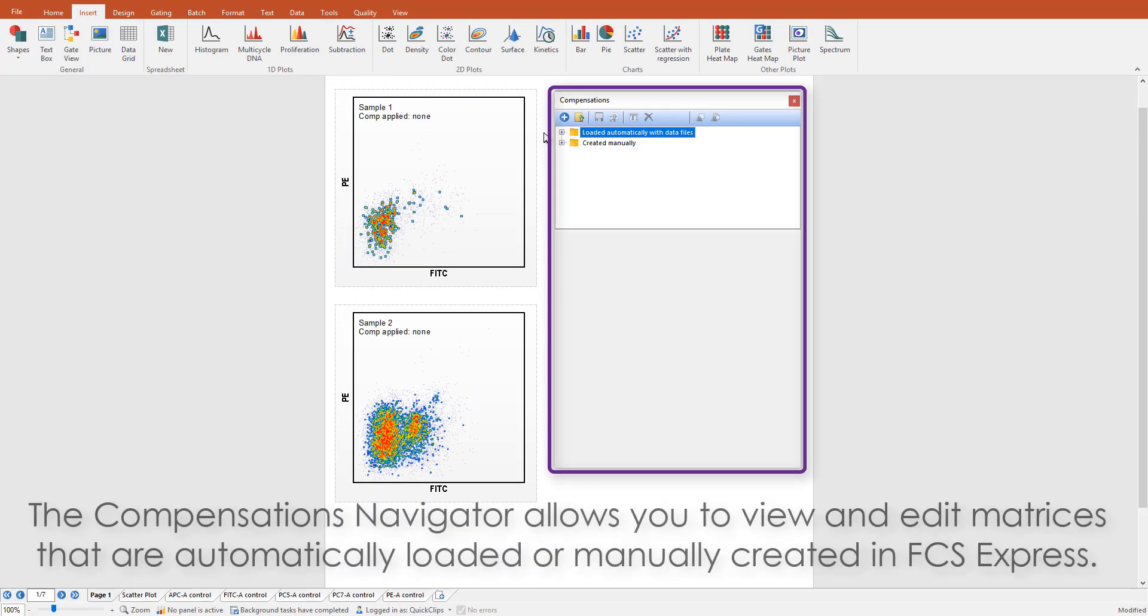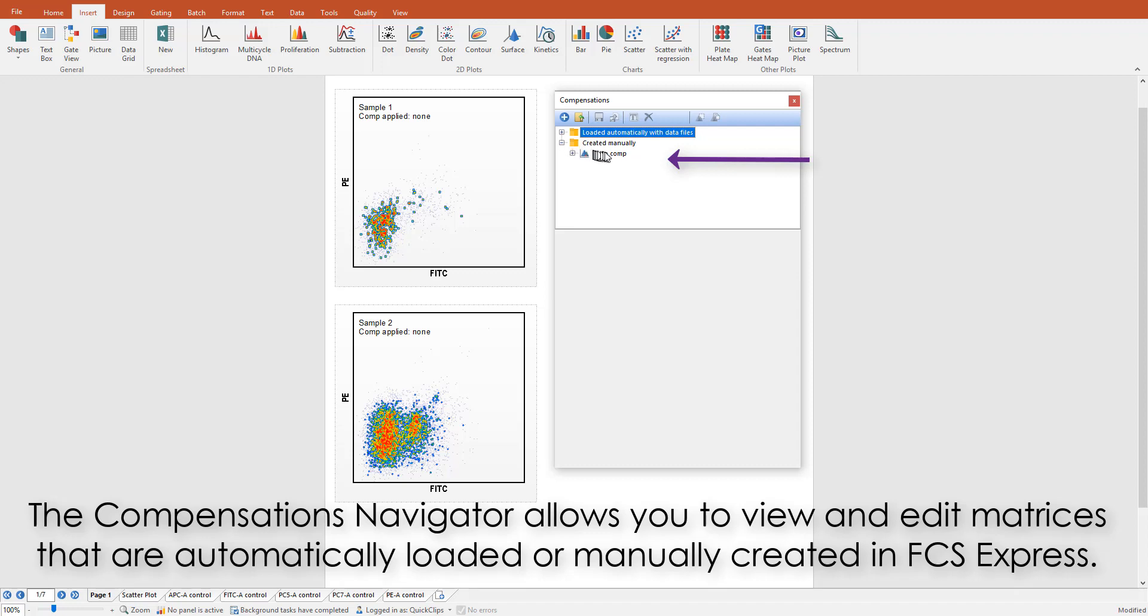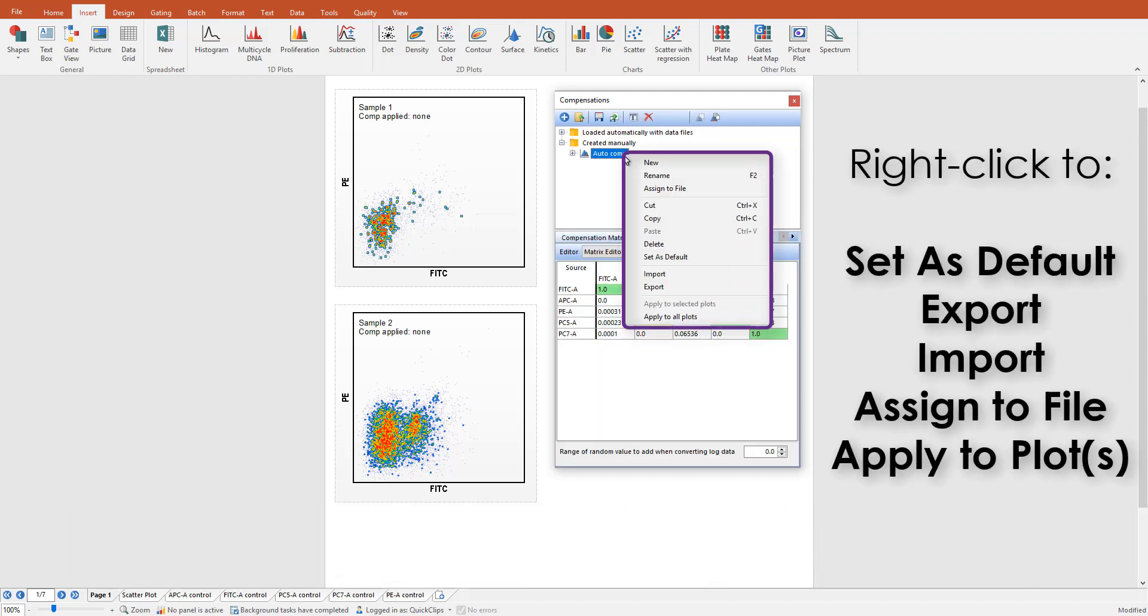The Compensations navigator in FCS Express allows you to view matrices loaded with data files or create it in the software. You may define a compensation default here. Export to archive or load compensation files into other layouts. Import previously created compensations to use in the current layout and assign compensations to specific data files or plots.